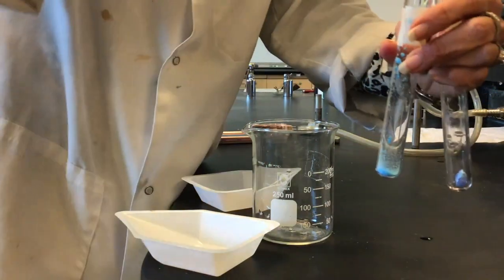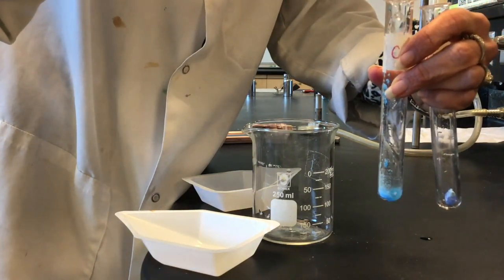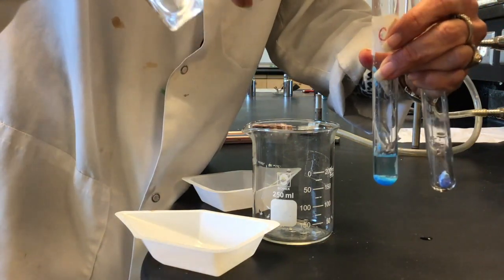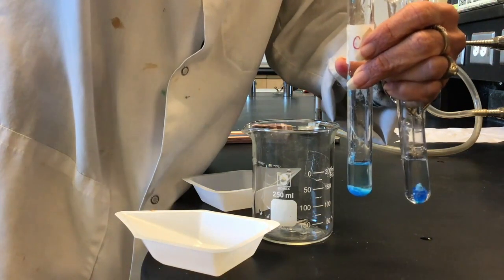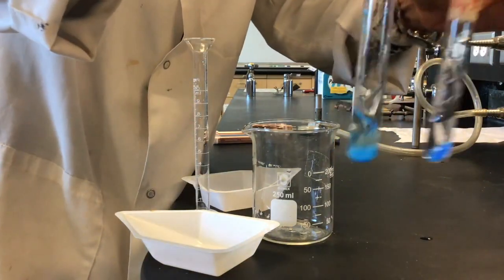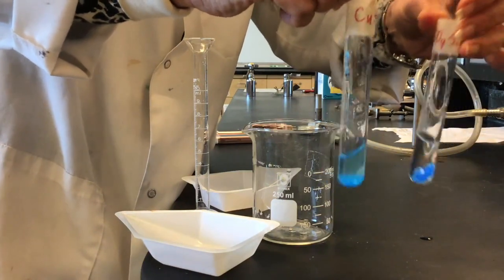And then I'm going to add 5 mL of water to each of those. And then I'm going to swirl them, and you can swirl these for 2 minutes.